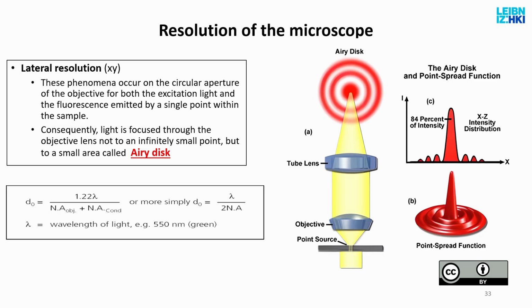So this means that when you have, I don't know, an extracellular vesicle 100 nanometers in diameter, and you put it in a microscope, and you realize that 100 nanometers is below the resolution of the microscope, then what you expect is that from each vesicle, you will not get a point-like image that would actually describe the proper size and shape of the vesicle. What you will get is a diffraction pattern.